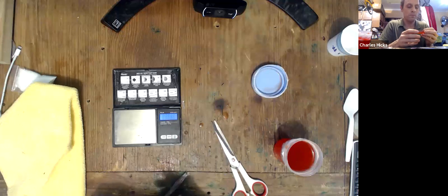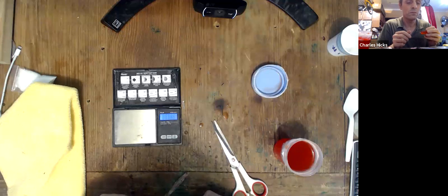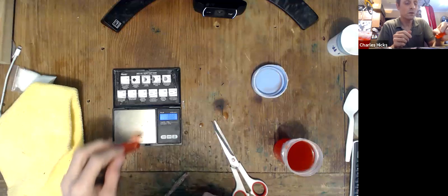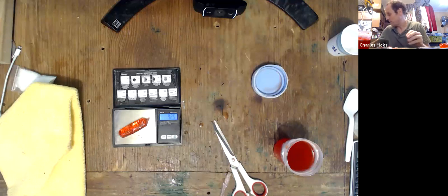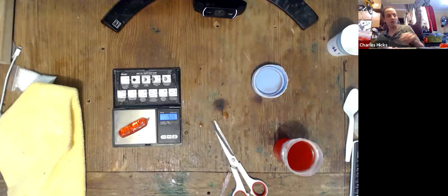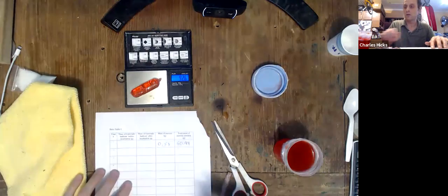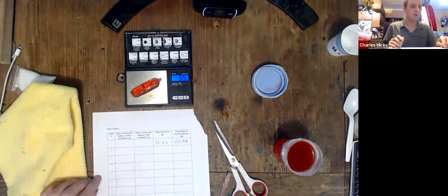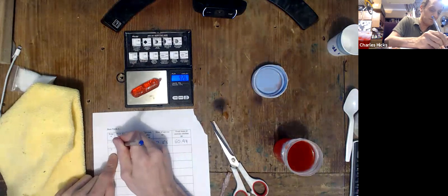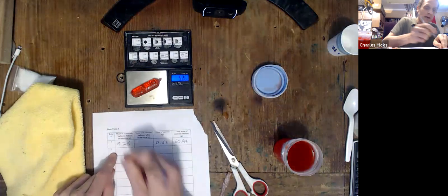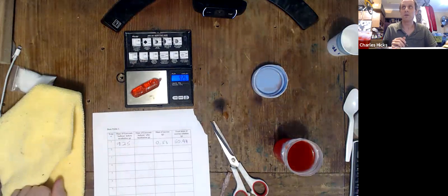Turn on your scale, place it on the scale. 9.25 grams. And you need to record that mass in the data table. 9.25 grams would be the mass of the Gatorade balloon number one. That's the one that I'm doing. And right now it's before it has been incubated.